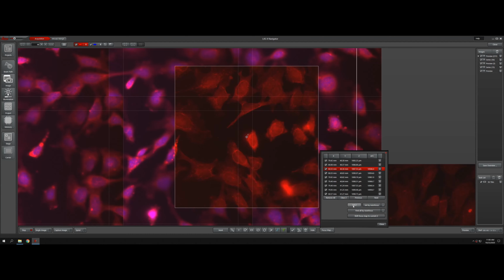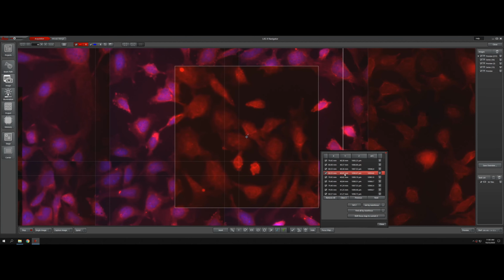So, me lowering the objective, I mean, these are mechanical devices. They're not super precise, and again, there may be some drift or temperature change, subtle changes which change the focus. So create the shading reference, I guess, before you do this.